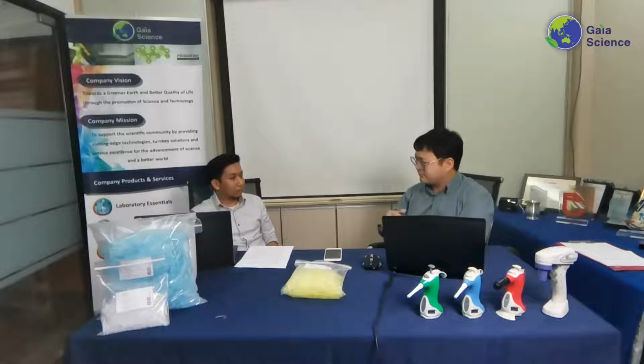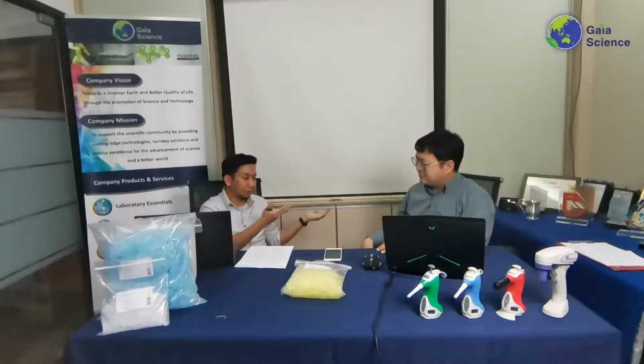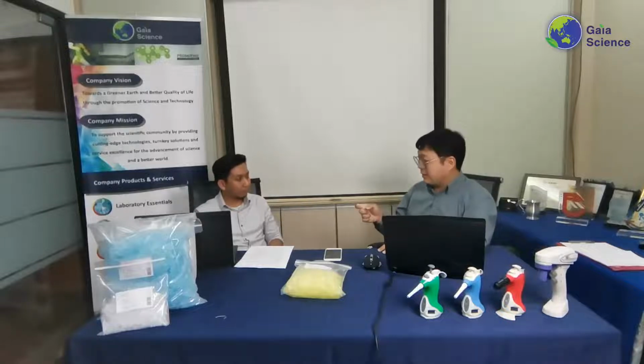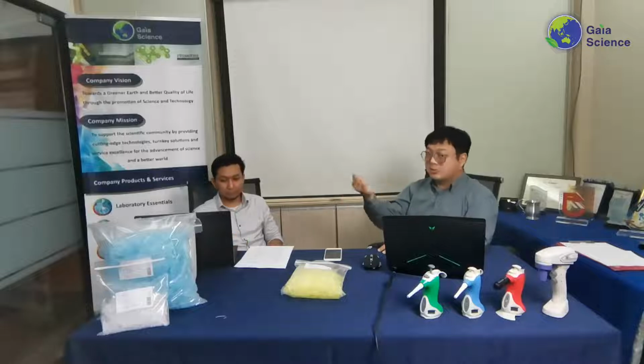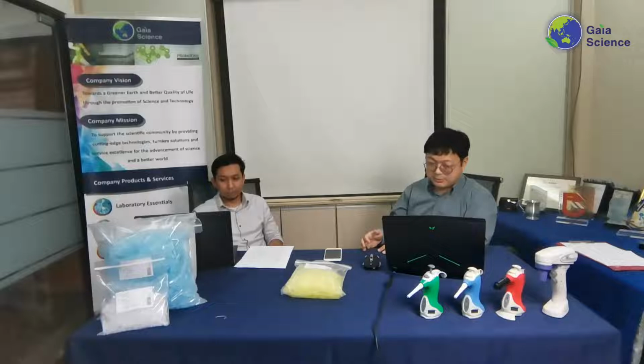Worse than that, now we go to a question about sterility as well. Let's say you're working with a very contagious sample, and then you accidentally contaminate your pipette. Can that pipette still be used? If your pipette can be autoclaved, that's fine, that's good. But how about if your pipette cannot be autoclaved, or cannot be fully autoclaved? That is something we always try to avoid. Yes, of course. I think the filter helps to prevent that as well, to make sure that nothing goes into the pipette and the next user doesn't cross-contaminate. I think that's the biggest one, on top of being sterile.